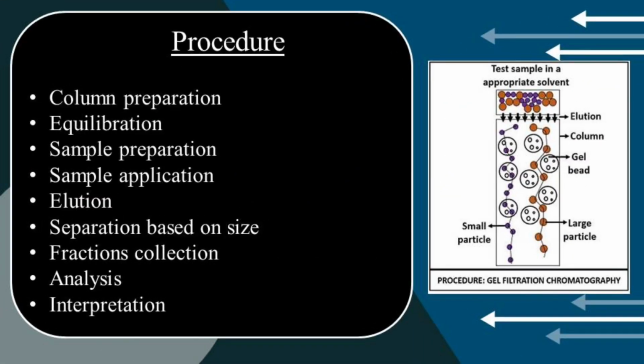When considering the procedure of gel filtration chromatography, column preparation, equilibration, sample preparation, sample application, elution, separation based on size, fraction collection, analysis, and interpretation are some examples.